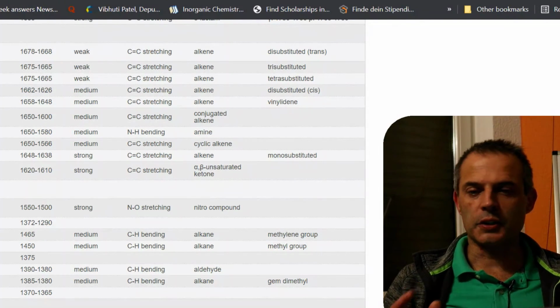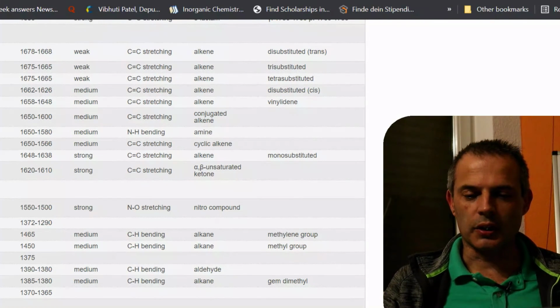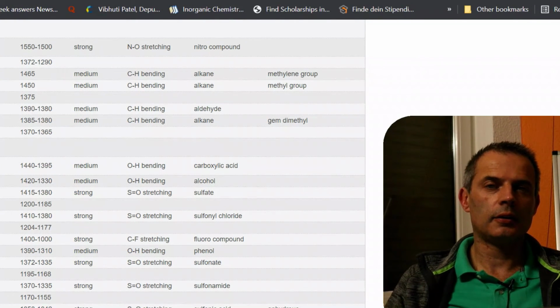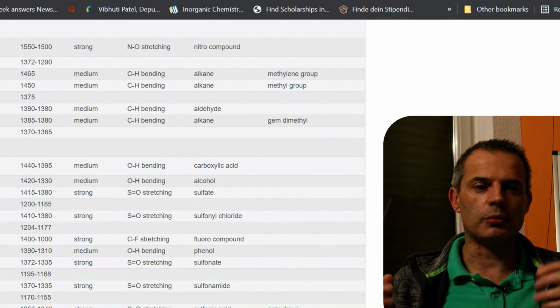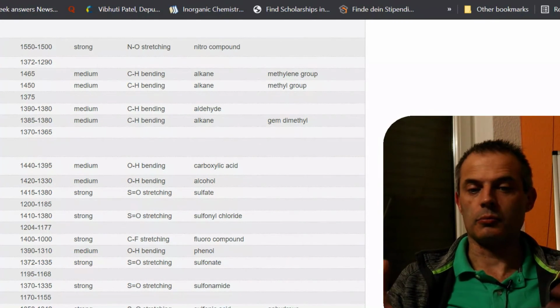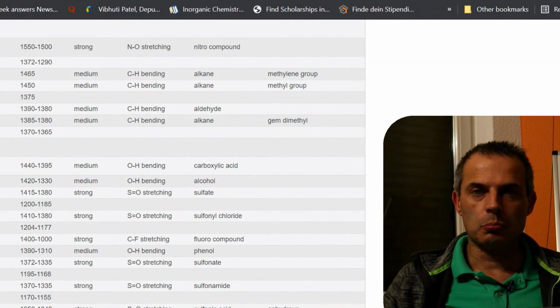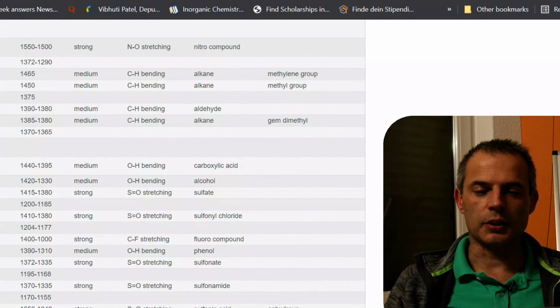So first of all, do the ones that are easier. But we'll go down to the next step on the table. So now we have bending of CH bonds. We had the stretching and the umbrelling beforehand, so this is a different type of movement of the carbon-hydrogen bonds, and we can also see these. Obviously, very often there are a lot of these, but it can be useful. As we go further along, we'll see there are lots and lots more things.